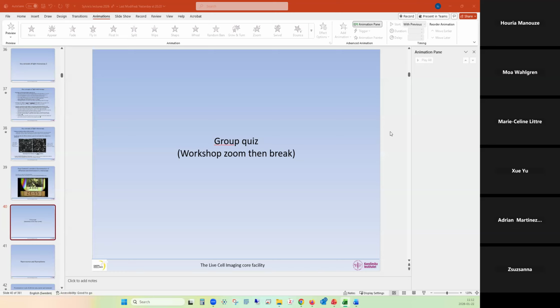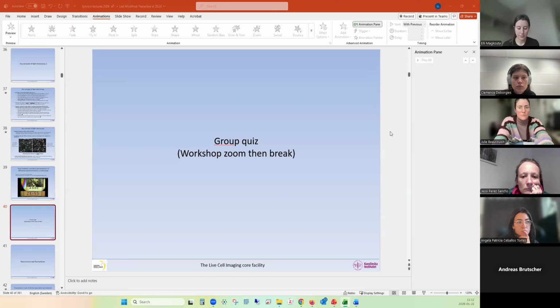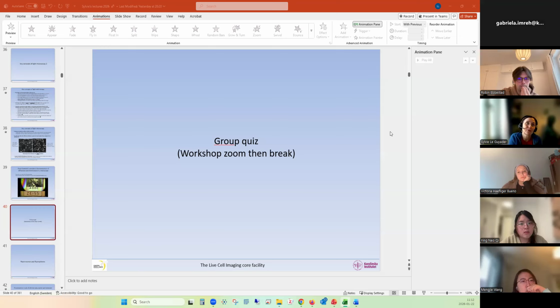What you can do, and Gabriela will explain all this to you, is a test: okay, what if I put 3 microliters? What if I put 4 microliters? You can do a test before you actually mount your sample, and then you will know exactly how many microliters you need to use. Thank you. You're welcome.